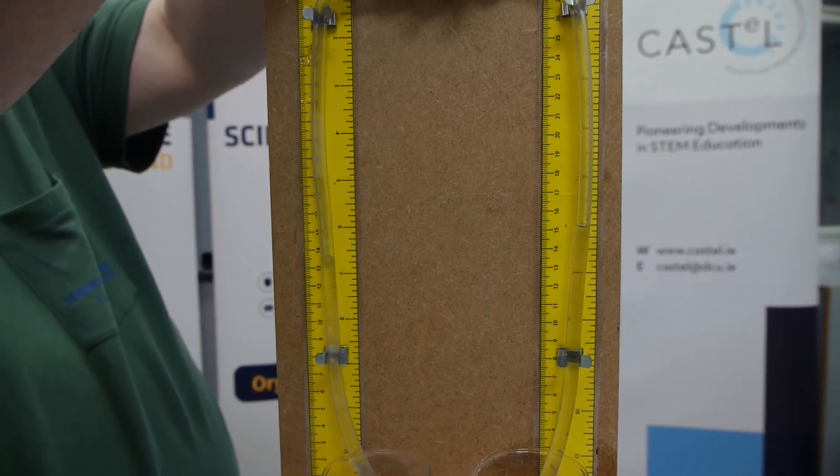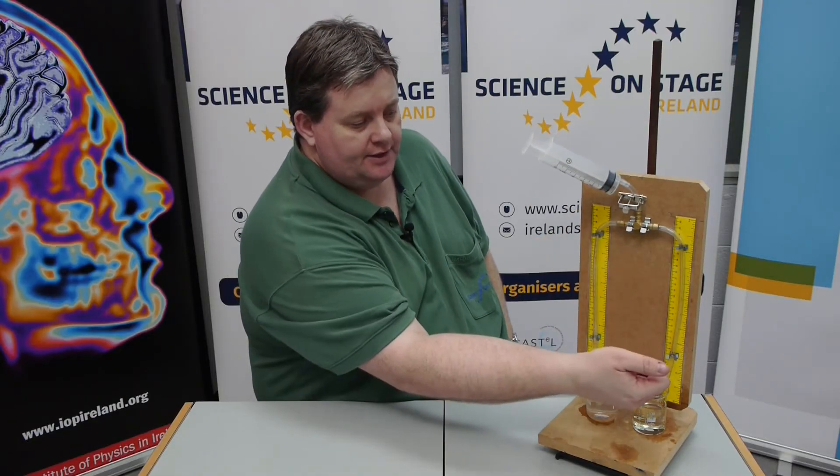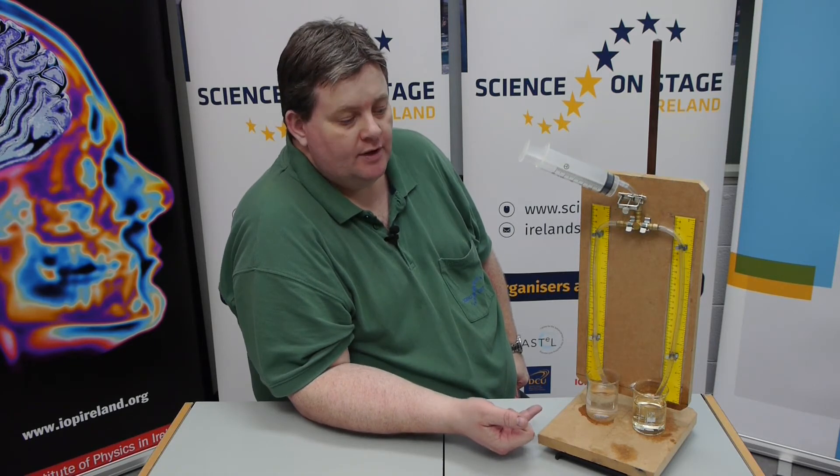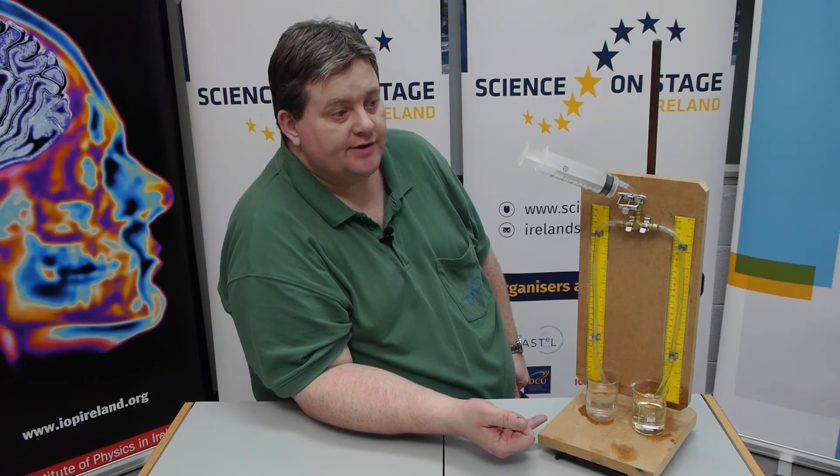Once you have tightened the clip correctly, you can take a height measurement of the liquids. You should find that the height of this liquid should be higher than the water, and when you do your division your answer should be less than 1. For most oils the answer would be about 0.92 to 0.96.